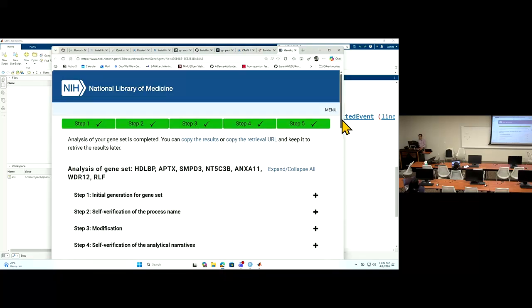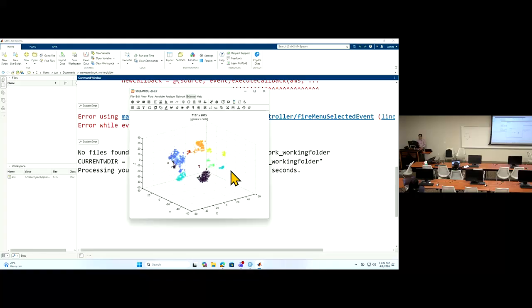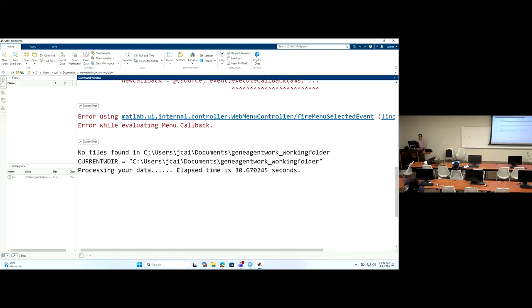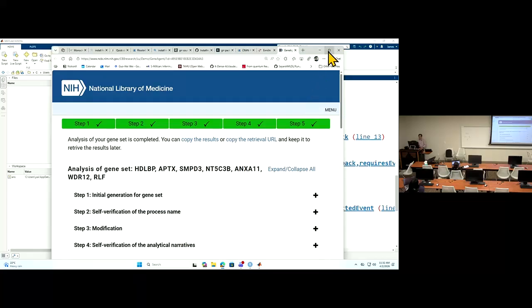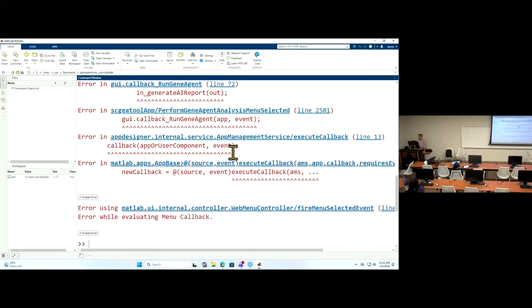Yeah, so now everything is done, and you can retrieve all these results here. You can come back here as well. It's done. So you should have better results. Let's see. Okay, something is wrong here.